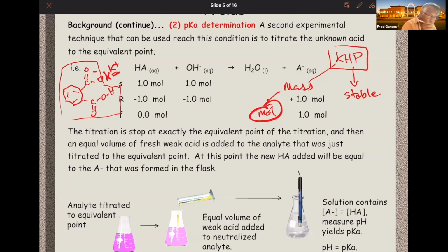Okay. So the Ka of this salt, and this is true for your unknown, is not Ka1 because it's not the first hydrogen that we are titrating. It's Ka2 because it's the second hydrogen that comes off. So when you look up your unknowns, a lot of your unknowns will be ionic substances. Make sure you understand which Kas to compare, because depending on whether we give it to you as an acid or the salt, you have to look up whether it's Ka1 or Ka2 that you're comparing your results with. Okay, and I'll talk more about that.